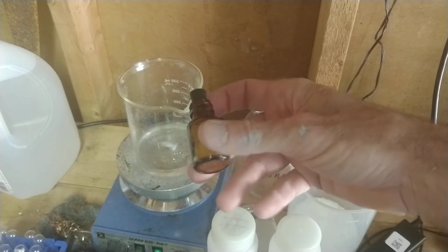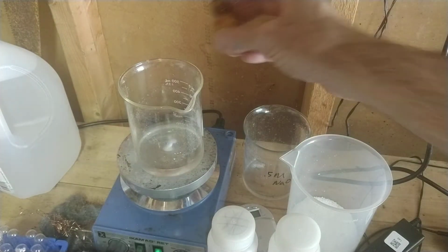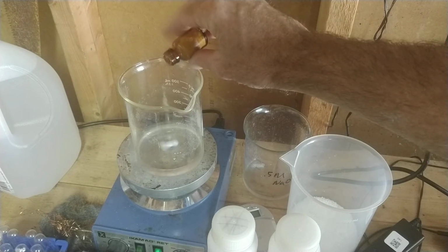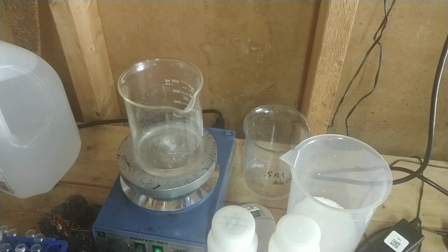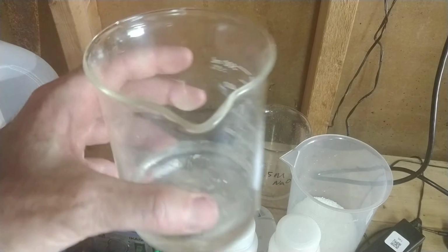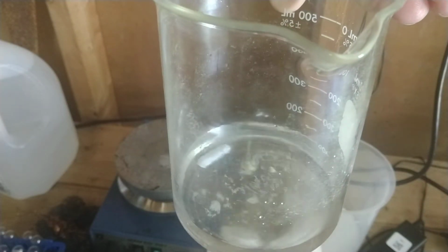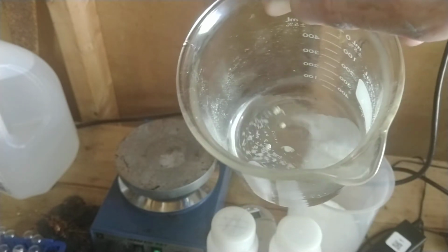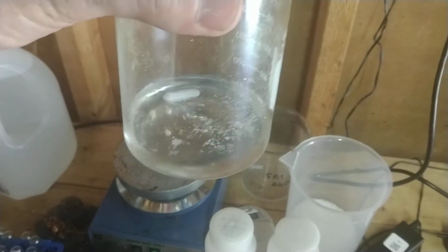Right here I've got some sulfur. Sulfur is insoluble in water anyway. When we talk about solubility in this video, I'm going to talk to you about solubility in water. If I put a little sulfur in there, you'll see that it doesn't dissolve. And I could put a bunch in there and it wouldn't matter. And there's the sulfur still just floating around on top of the water. And it's dry. It's weird. It's very weird. But sulfur is insoluble.